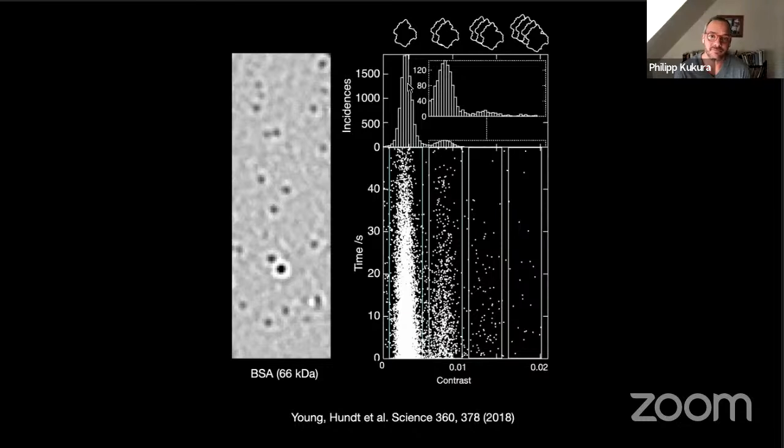So the mass spec specialists do it in a slightly more interesting manner. They do tandem mass spec, or they can do multiple sequential mass specs, so that increases a bit of the information content. Maybe a perturbation on these proteins separately can also be used as in your method. Maybe a perturbation of these aggregates could be used to look for that information as well. Maybe, I don't know. We're spending a lot of our time trying to think about how to implement approaches that are completely standard in mass spec, how to do them here, right?